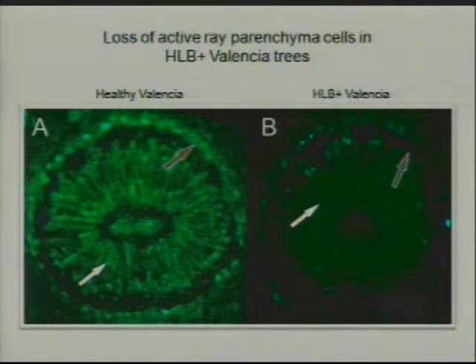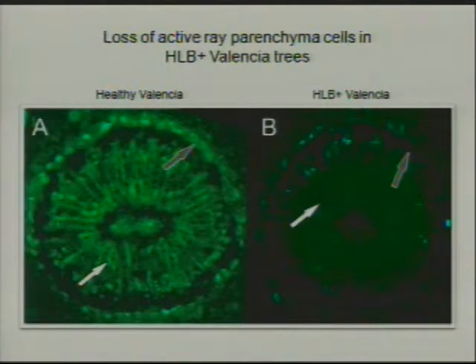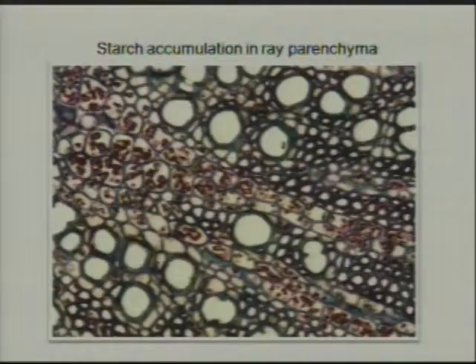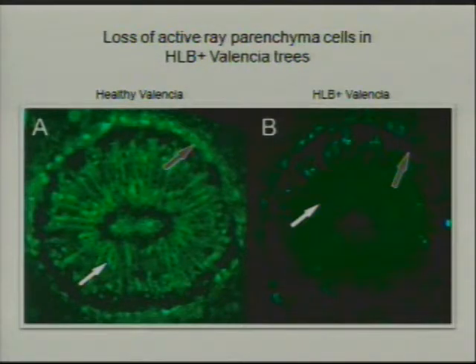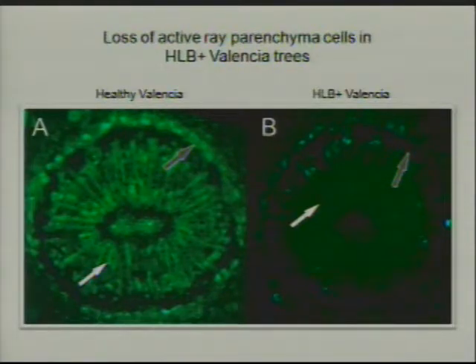On the left we have a healthy Valencia petiole and on the right an HLB-infected petiole. We stained it with FDA, which shows where the living cells are — anywhere there's a bright green spot, there's a living cell. In the healthy tissue, the white arrows indicate parenchyma tissue gorged with starch granules, and all those cells are active and living. These bright green spots are active and living in the ray parenchyma.